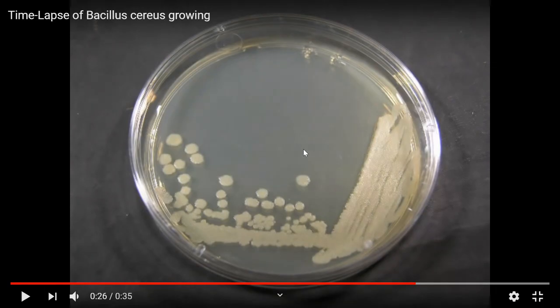Probably from the first streak. Yep, in zone 1, in fact, in the middle of zone 1, right? Because that's where the thickest, densest growth is. So that's where conditions are going to deteriorate first, in the middle of zone 1. So that's where you get your sample to look for spores.